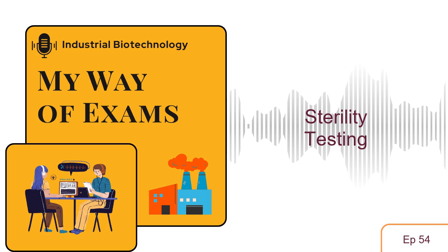Exactly. You got it. Okay, so after that 2-week wait, what happens? All right, so after the incubation period, it's decision time. We have 3 possible outcomes. The best case scenario, of course, is a pass. That means absolutely no growth in either broth. Crystal clear. That's what we want. Exactly. Now, if we see any growth, any cloudiness at all, that's a fail, and that triggers a whole investigation.